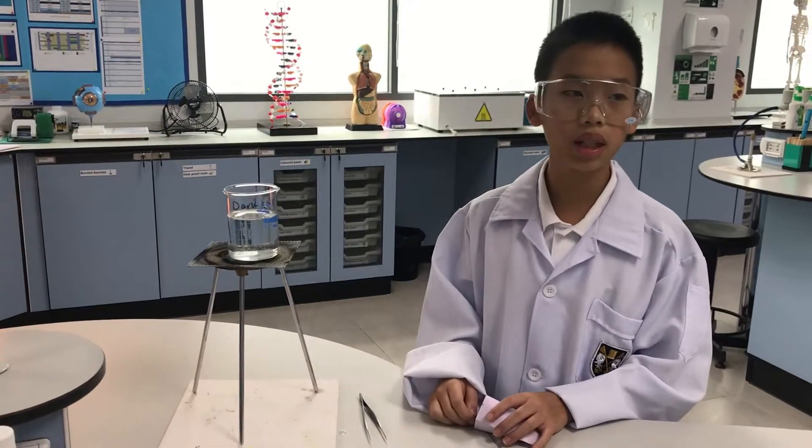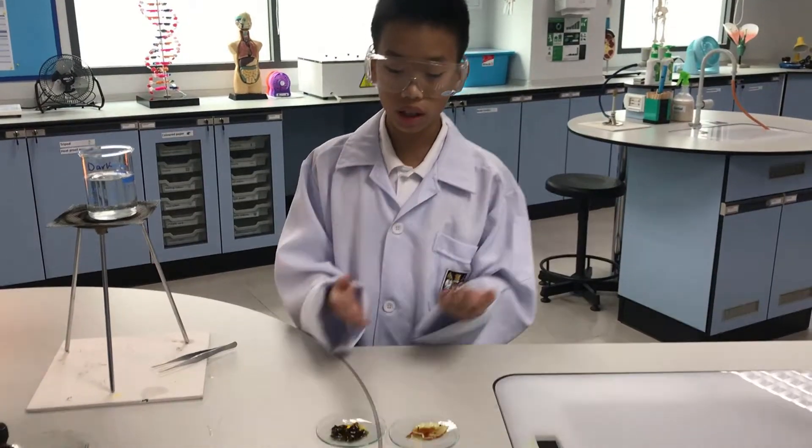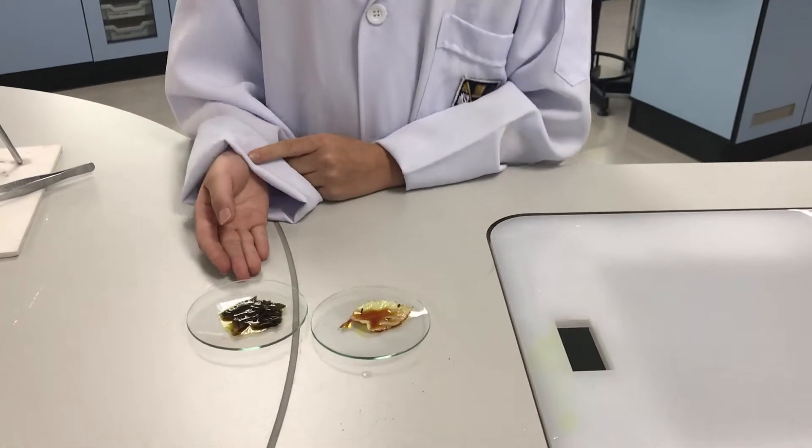Now we'll repeat the experiment using the leaf that is kept in the dark. This is what the results look like. One leaf has turned bluey black — that means starch is present.